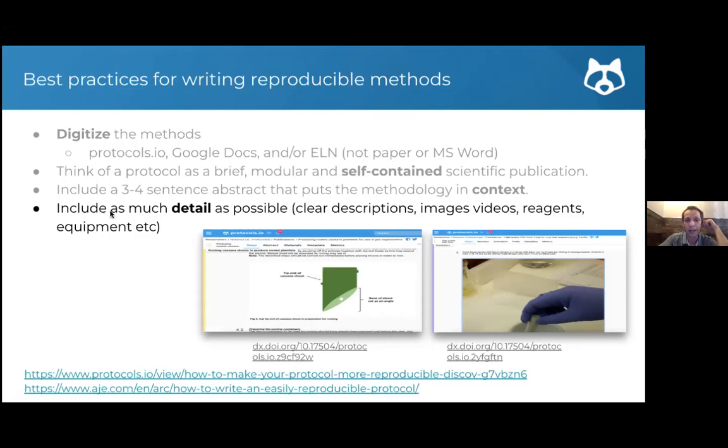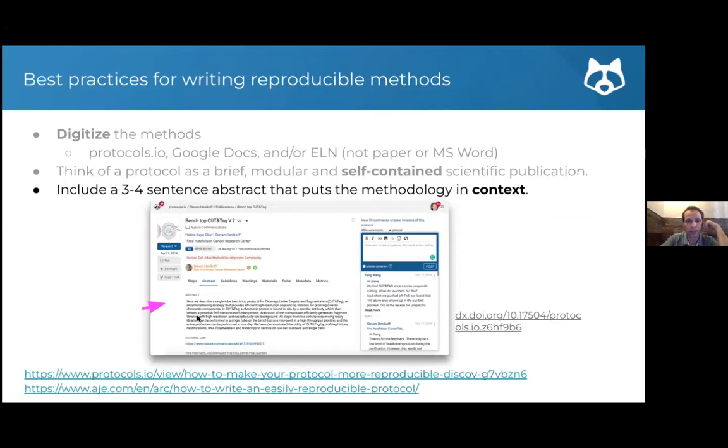And a note about the details that I think is important, when you look at the different sections of the protocol in here, think about where the details go. And I like to talk about 2 groups of users of a protocol.